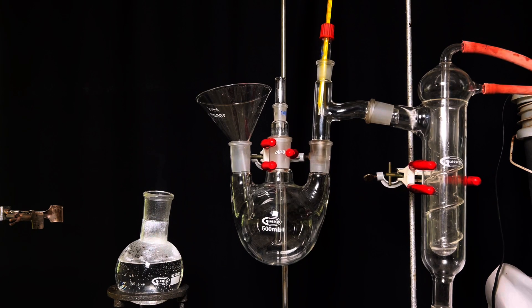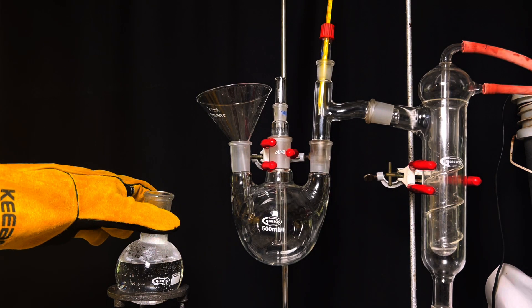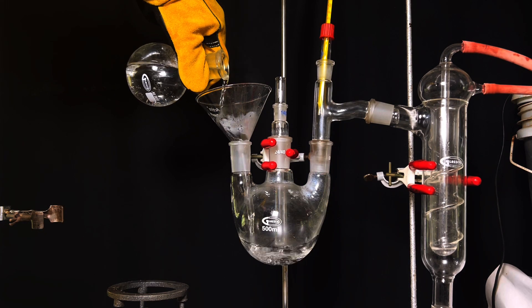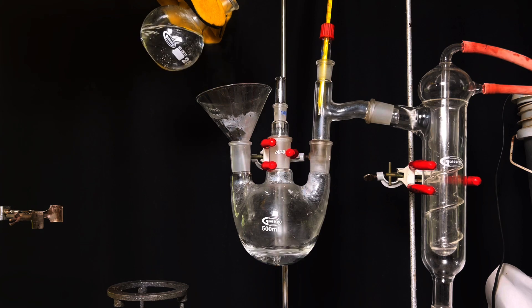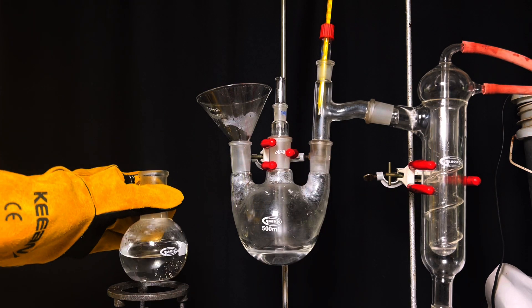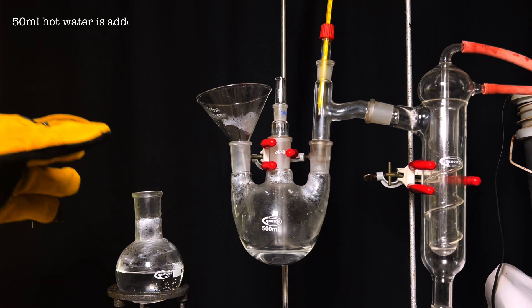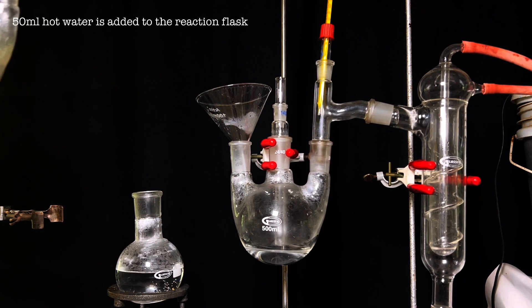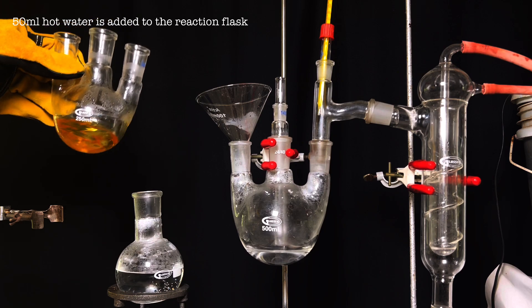Next, we will need a steam distillation system. All the glassware and connections you will see here are part of the steam distillation system. In the center, we have a 500 ml three-neck round bottom flask and this will be our reaction flask. Approximately 50 ml of hot water was initially poured into the reaction flask.